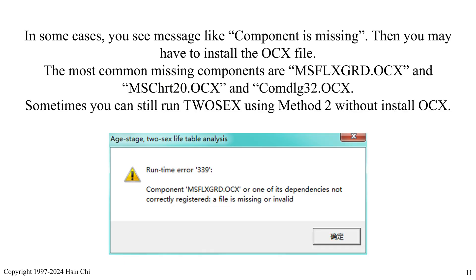In some cases, you see a message like 'component is missing.' Then you may have to install the OCX file. The most common missing components are msflxgrd.ocx, MSChrt20.ocx, or comdlg32.ocx. Sometimes you can still run TWOSEX using method 2 without installing OCX.